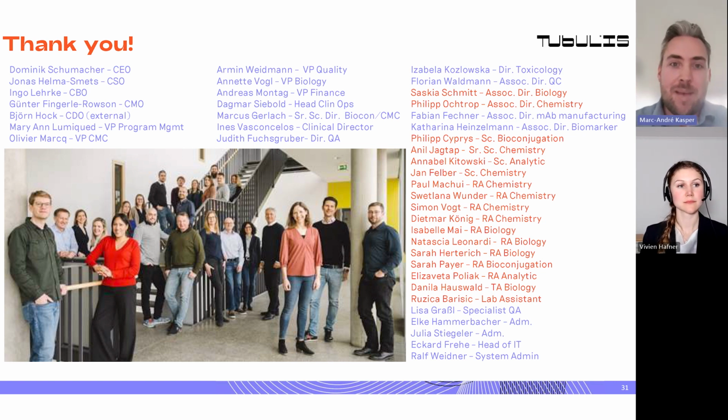So what you usually aim at is something like a DAR2 to a DAR8 format. And if you want to modify these almost 100 lysine residues with only 8 drug molecules, you end up with a very heterogeneous mixture. Potentially you could have a couple of million different ADCs, and it would not be defined. And this is something that regulatory authorities usually do not like too much.